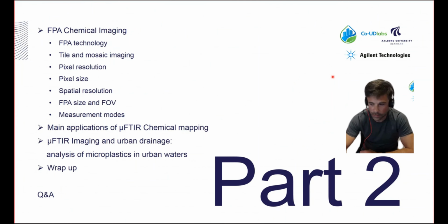For the second part of the seminar, we will go into more detail about FPA chemical imaging. When we use this array of detectors instead of a single one, which is the best configuration to do chemical imaging, and we will go through some important parts of it.